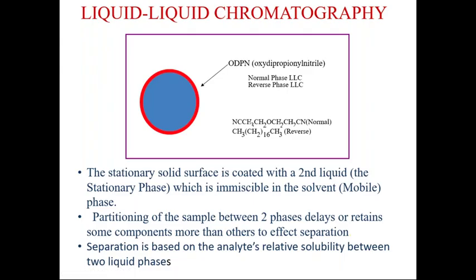So now let us talk more about liquid-liquid chromatography, which is the most widely used HPLC technique. In liquid-liquid chromatography, if you recollect, an inert stationary phase is coated with a second liquid, and this liquid will be immiscible with the mobile phase.